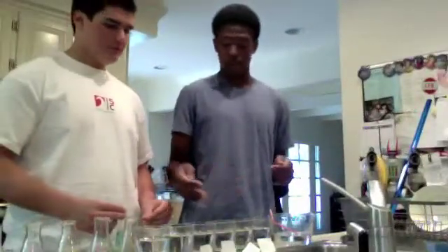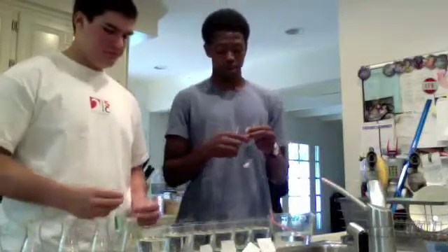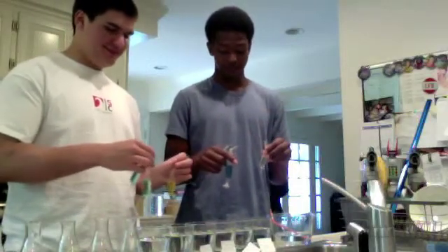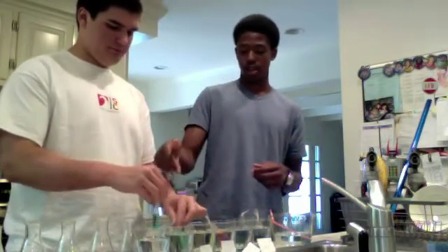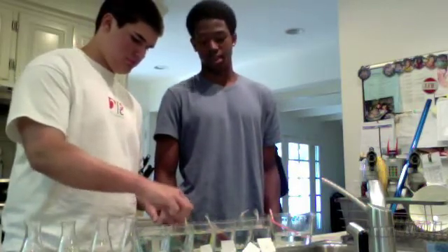After we have marked all the beakers with which molar solution is inside of them, we will carefully place all of them at the same time into their respective beakers: water, 0.2, 0.4, 0.6, 0.8, and 1.0 molar solution. Now they sit for 30 minutes and we wait.